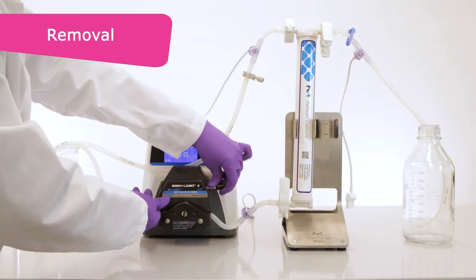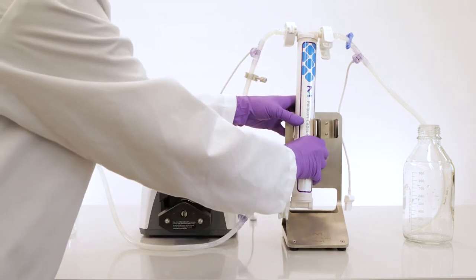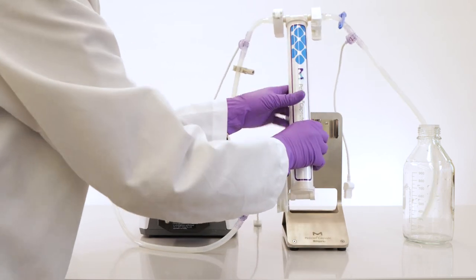You may now clear your TFF system by removing the pelicon capsule and remaining flow path, leaving your space open and clean for your next batch.